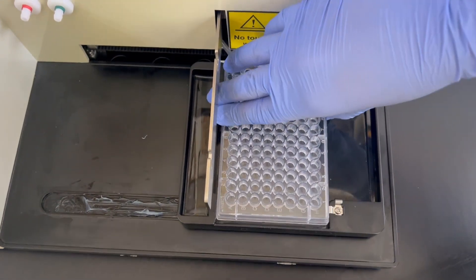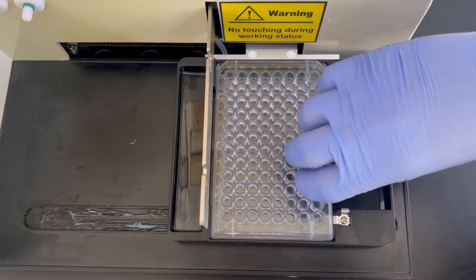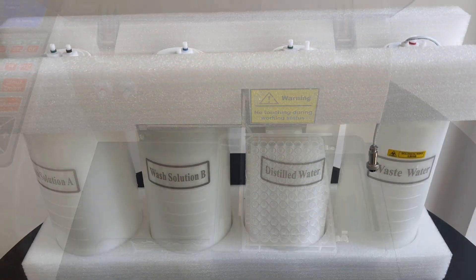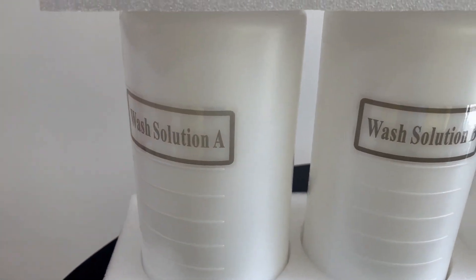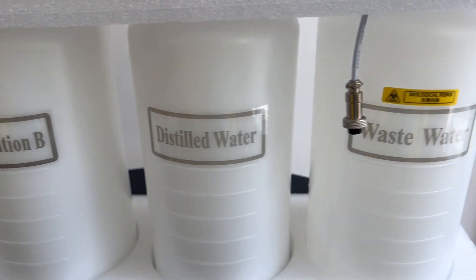The wash bottle filter effectively prevents sediment from entering the solution and clogging the pipes, ensuring optimal performance. Our advanced pump pressure control technology maintains smooth operation throughout the washing process.